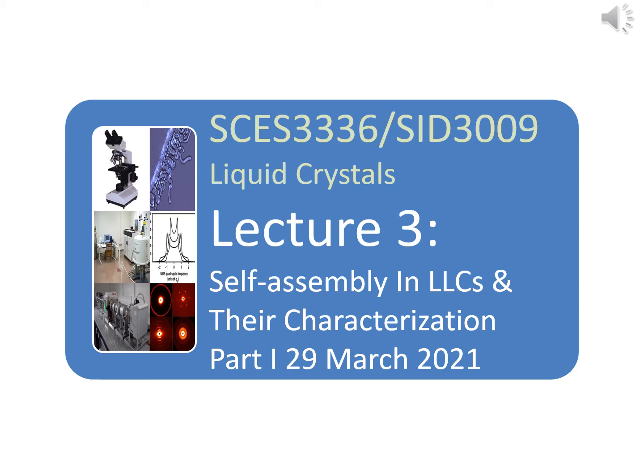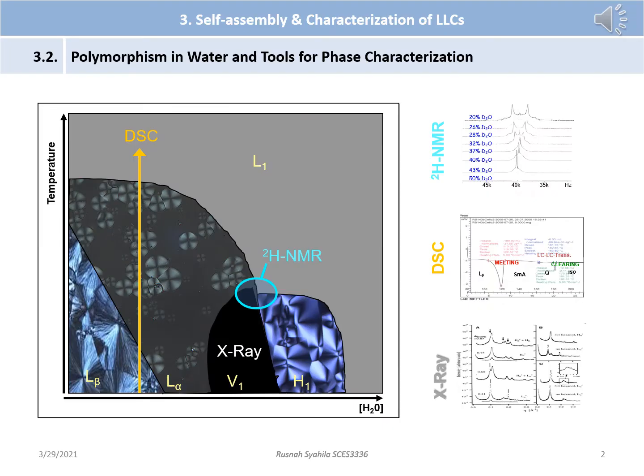Today, I will show you how we identify the liquid crystalline phases, part 1. Liquid crystal phases can be identified by a variety of techniques. We will discuss some of these in this slide.